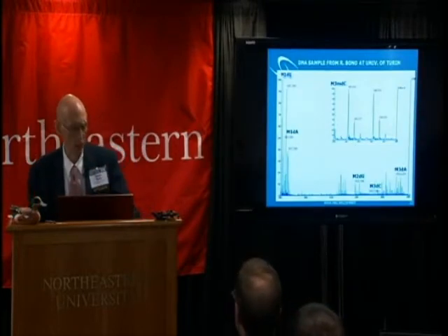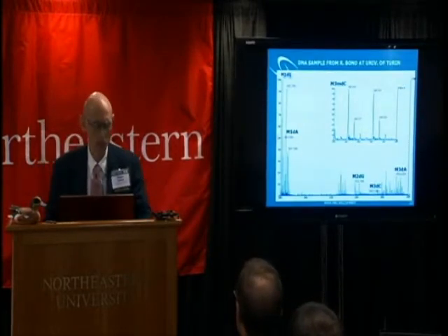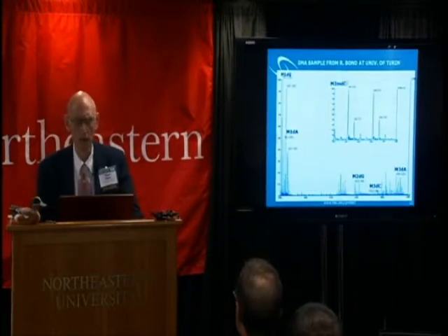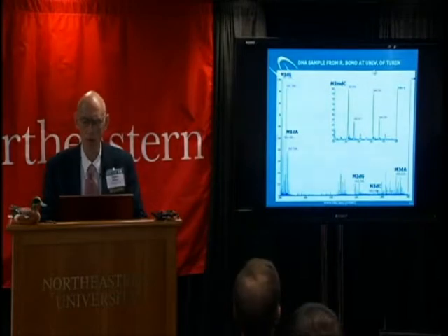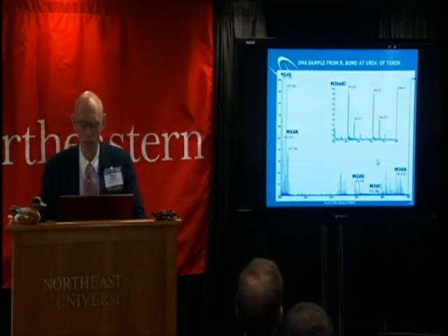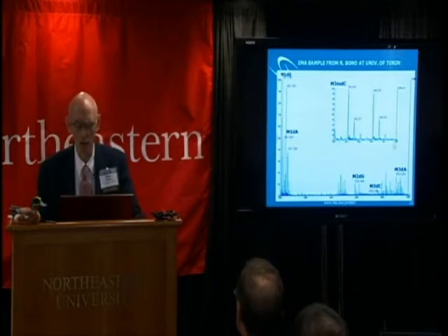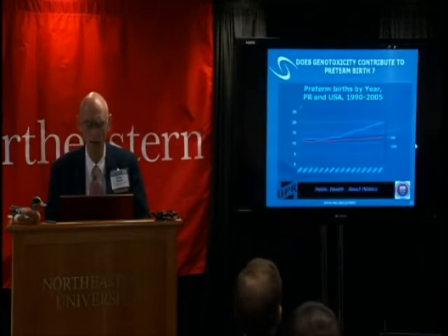We have some collaborations underway with this. One application area is preterm birth. This one is from an investigator at the University of Turin, and this project was exposure of pathologists to formaldehyde, and then we did some DNA adduct profiling of some standard samples.